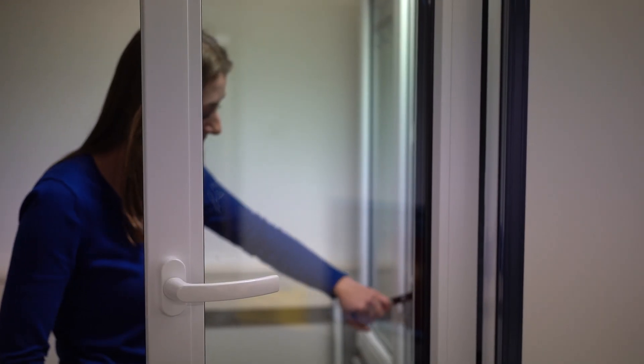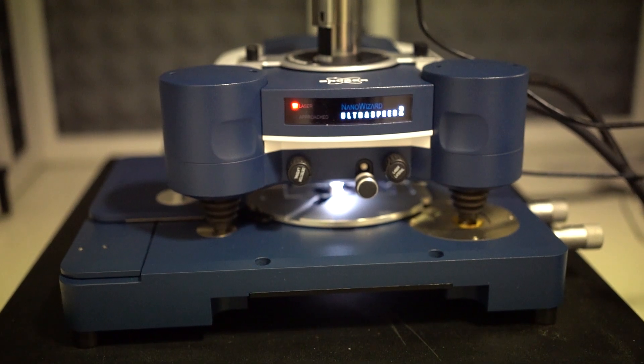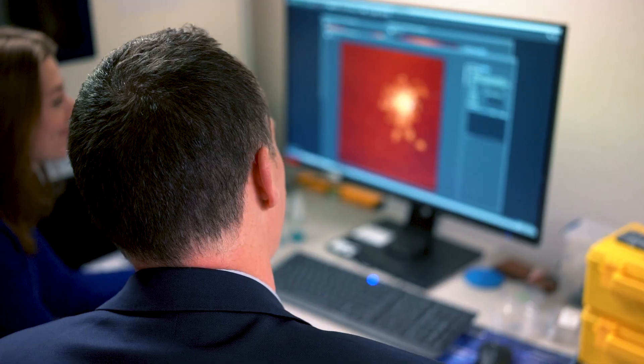Welcome to our Atomic Force Microscope, or AFM for short. Now the DNA that we made upstairs, we can now put under the atomic force microscope. Let's have a look. So now we actually have an AFM image of our DNA. This spaghetti-like object — that is DNA — imaged at about one nanometer resolution.